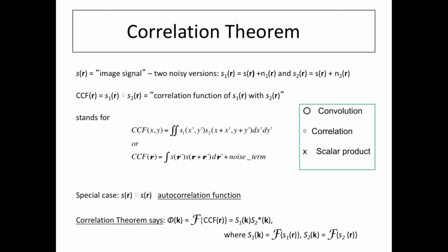All right. So we have this one, and in this case we have a plus here. That's the only difference from before. So let's say we have one image of a certain particle field, and then it's the same signal plus a certain noise term.